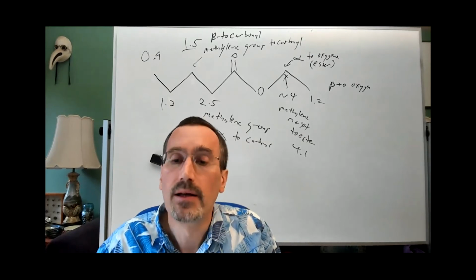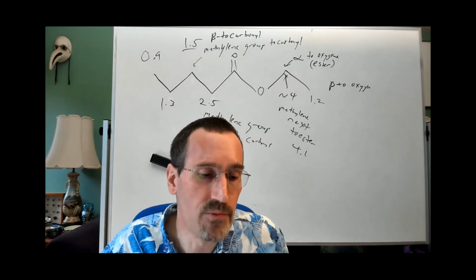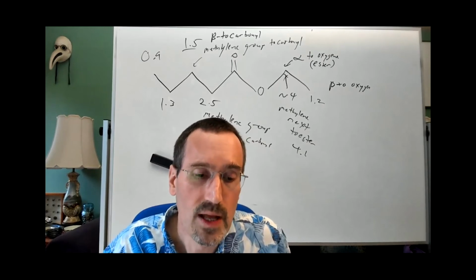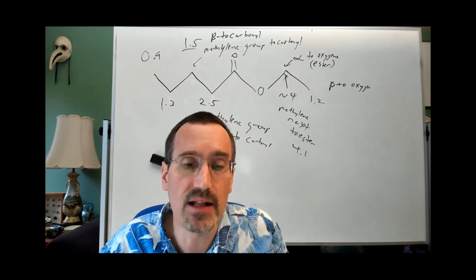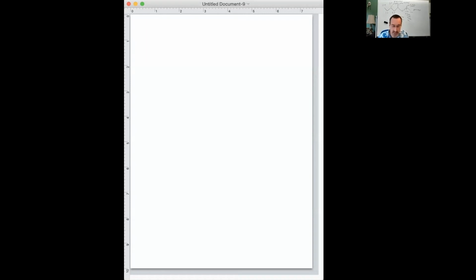Now, I'm going to launch ChemDraw here. I want to show you very briefly. This is a useful tool. As I said, having knowledge in your head, having that intuition, that calibration, nothing can replace it. That's the ability to read, but being able to get a little bit of help can help you along. And I encourage you to use available tools like this.